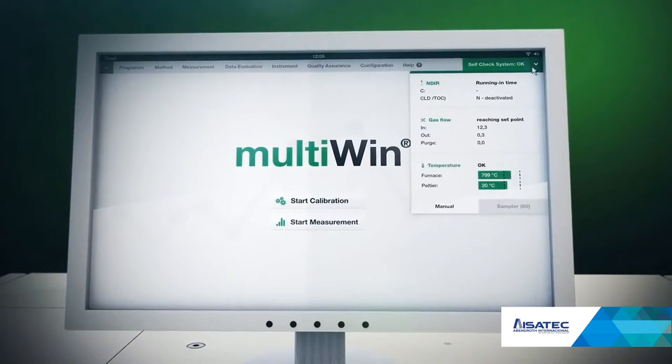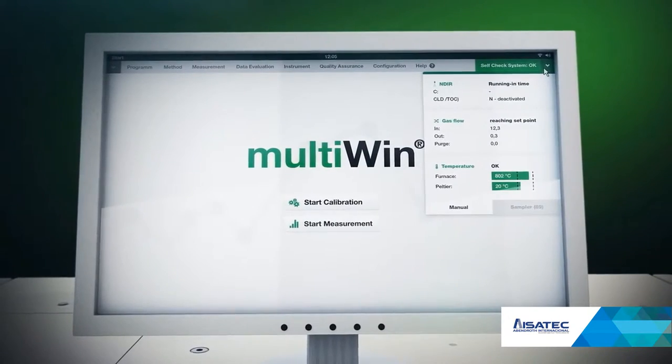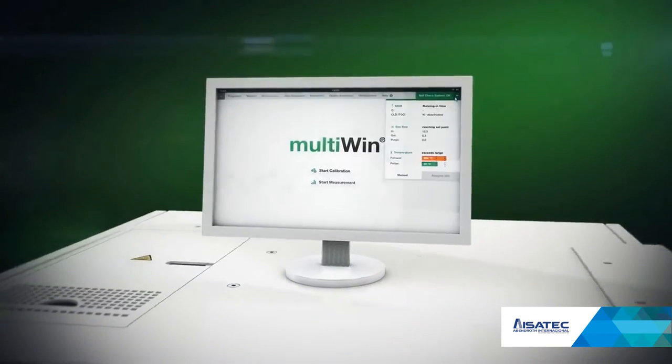The integrated self-check system enables safe and unattended operation of the instrument.